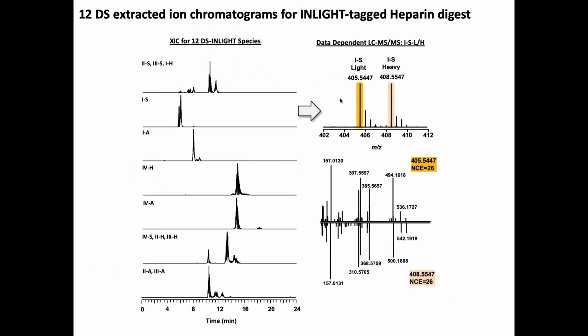These are just some extracted ion chromatograms showing you the individual peaks and where they're coming off for retention times. So this is a reverse phase experiment where all 3 of these have the same molecular weights. And so when you say, give me just these, the things that are molecular weight plus or minus some mass accuracy, you're getting 3 different species. This guy, you get 3 species. Should only be 2. These guys are singles, and these guys are 3s with some other noise.